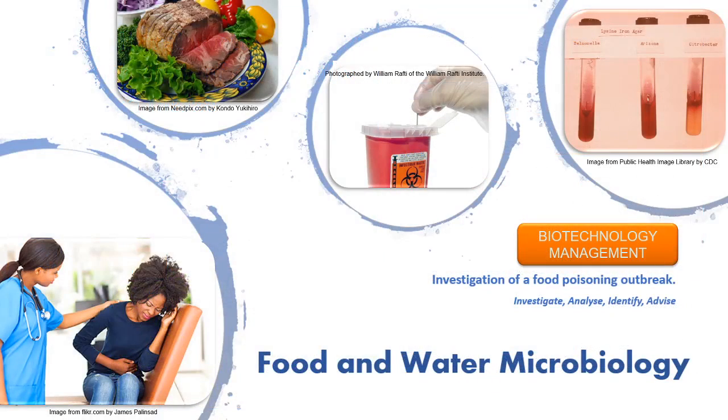Food and water microbiology. Imagine the following scenario. A group of individuals fall ill after a dinner function, and you need to investigate this foodborne disease outbreak. You begin by evaluating the disease symptoms in order to narrow down the probable causative agent. This is then followed by a detailed analysis of all implicated food samples, which leads to an identification of the causative agent. Your task is also to advise on how the agent has entered the implicated food source and measures that can be employed to prevent or minimize the likelihood of a reoccurrence of such an outbreak.